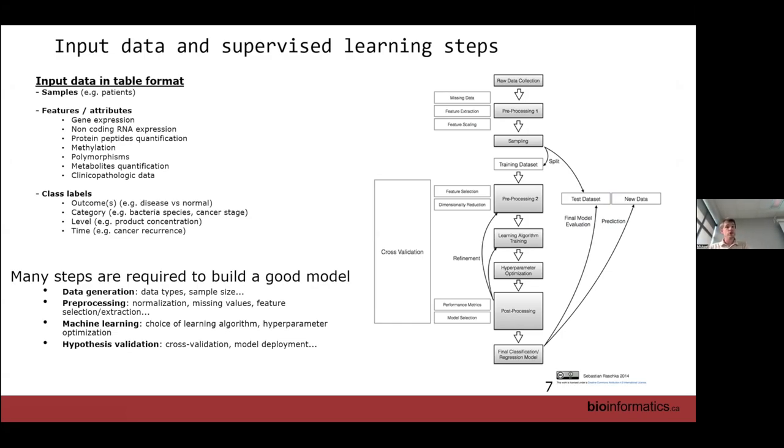And there is also the choice of algorithm. There are many of them. Each algorithm can be parameterized differently, so there is also an optimization on it.